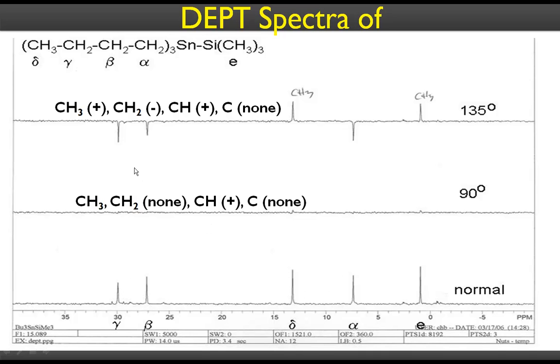I just don't know why that is so, right? Nevertheless, we were just asked to assign. Oh, I know that, because this is methyl, and methyls have more shielding effects, so they are much towards your right hand side. These are methylenes, so though they are beta and gamma, they are on this side, and this is also farther away, so that is deshielded, right? Okay.